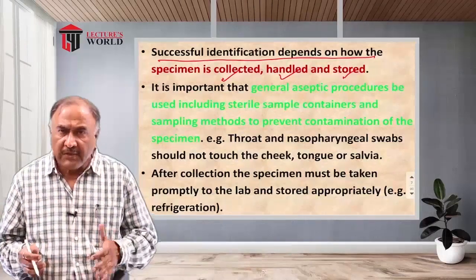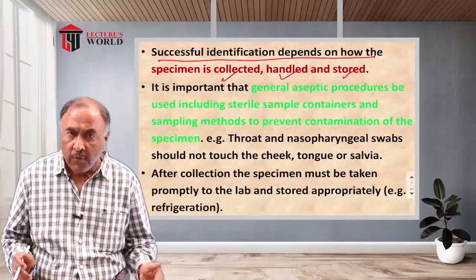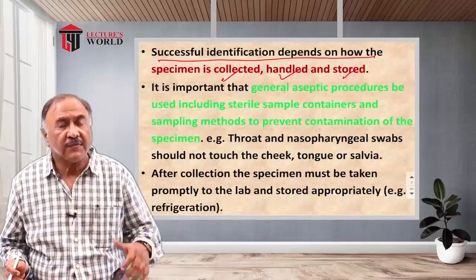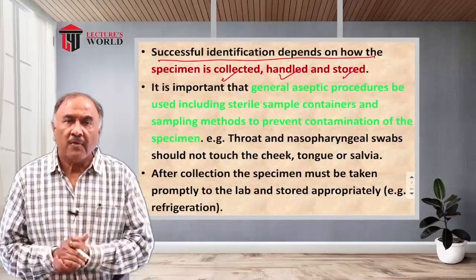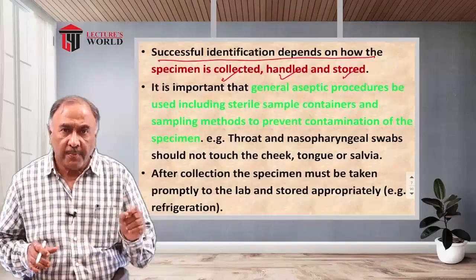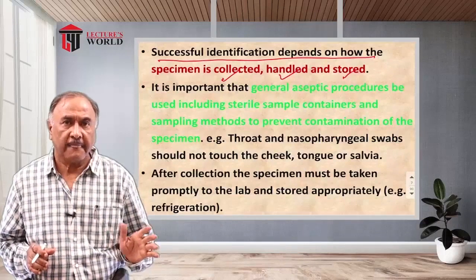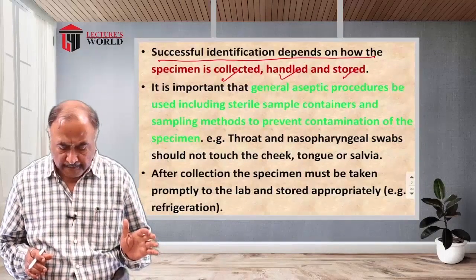We do this entire exercise, aseptic procedures, use of sterile containers, as well as sterile sampling techniques, with the primary objective of avoiding contamination of the specimen.